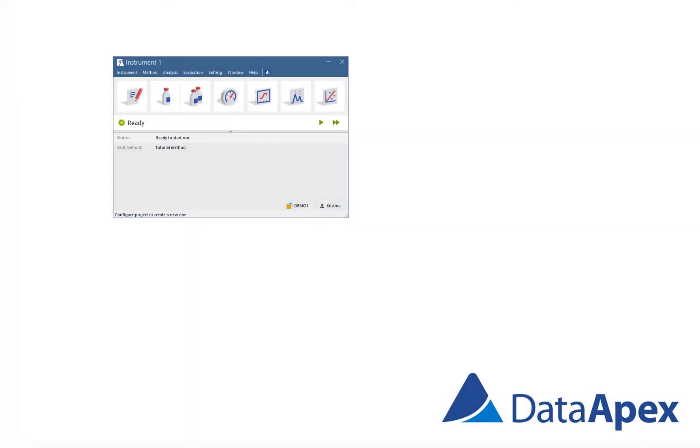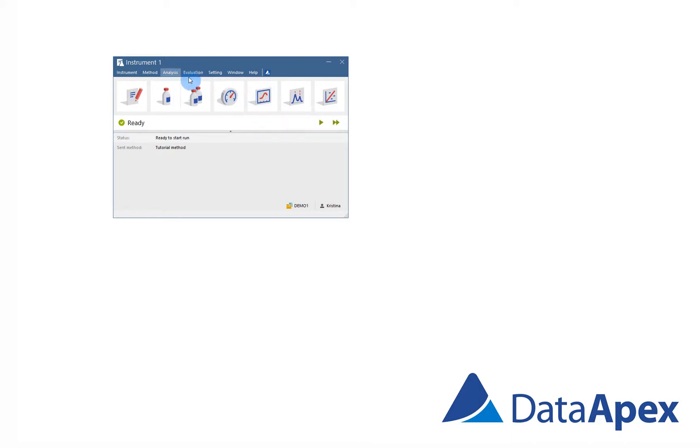Open Data Acquisition window from the Instrument window using its icon or from Menu Analysis.